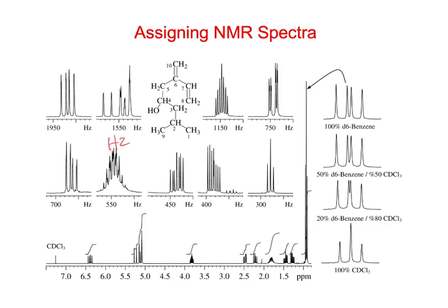Where would they show up in the spectrum? 750 hertz. Because there's 2 doublets. The 750 here. Well, 750, that's going to be this one that's down at 2.5 parts per million. So if we look at the actual spectrum with the parts per million, so H10, where do we think it would be?